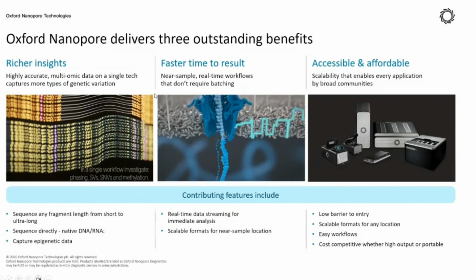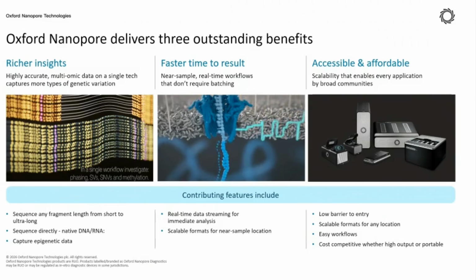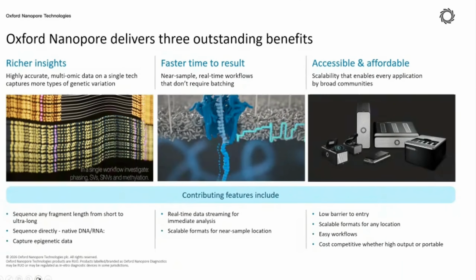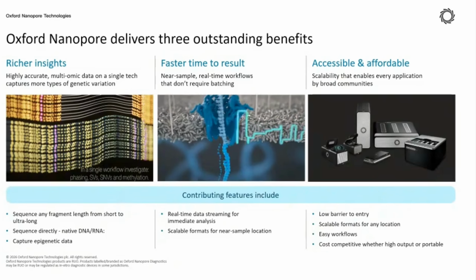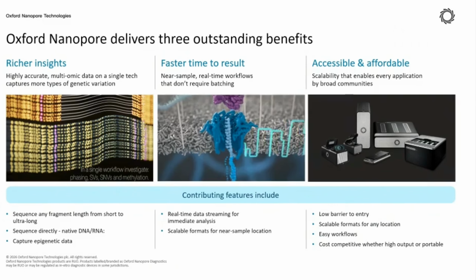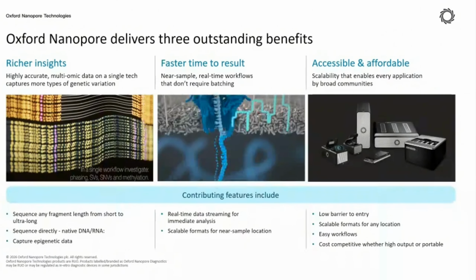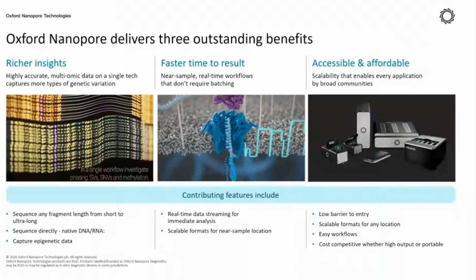So this is different in ONT. While the sequencing is still running in the device, we can already get the data out, and then we can see whether the data is within our expectation. If we are seeing there is sufficient data obtained from the sequencing run, we can stop the sequencing anytime by looking at the real-time sequencing process.